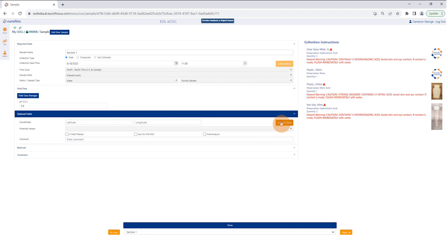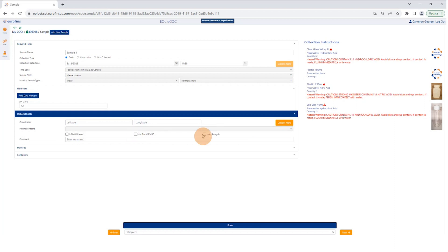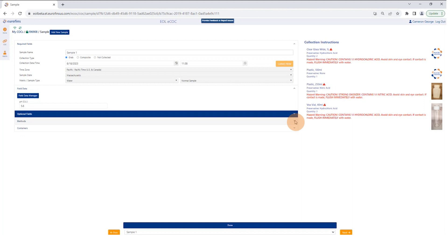You're able to record the longitude and latitude if you want, a place to note any potential hazards, some checkboxes for whether this is field filtered, if this is QC for MS/MSD, or if this analysis is on hold. You also have a location to put comments that you want to communicate to the laboratory.